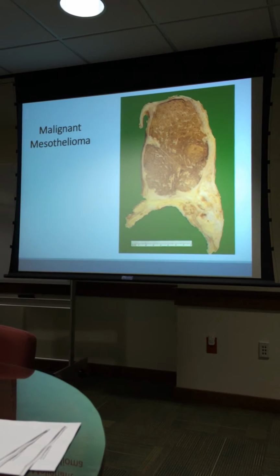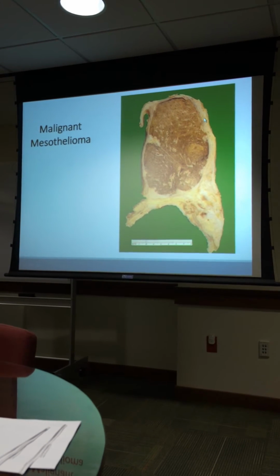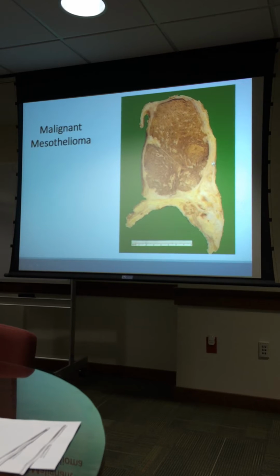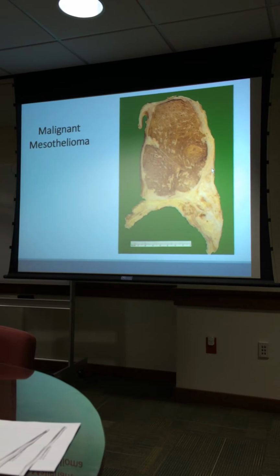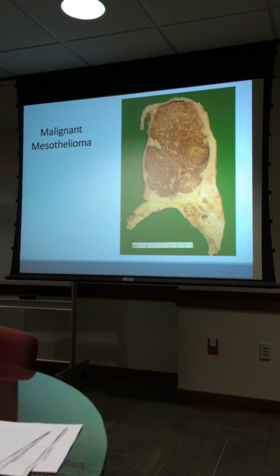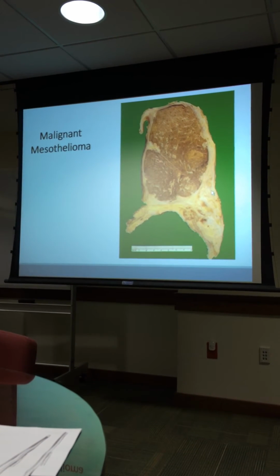And again, this is a cross-section of the lung. This is all normal lung. The mesothelial cells, as I said earlier, are on the outside of the lung. This thick rind of white stuff is actually mesothelioma that's encasing the lung. So they'll see this on, they'll put together what we're seeing in cytology or hematology, telling them that they have a cellular specimen with a lot of mesos.